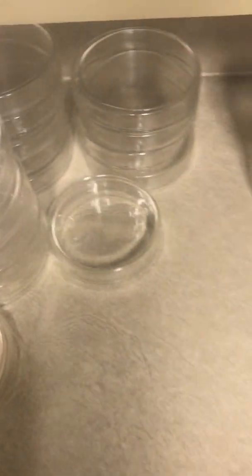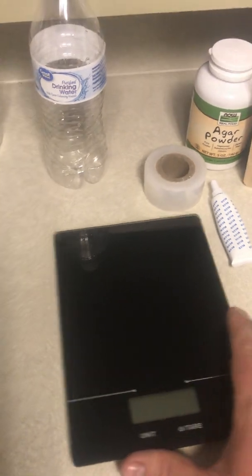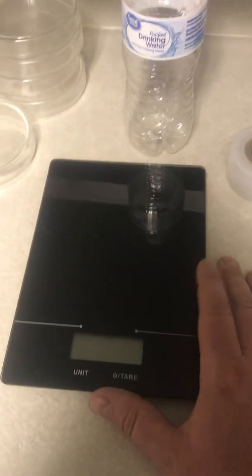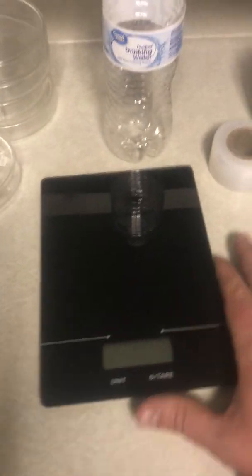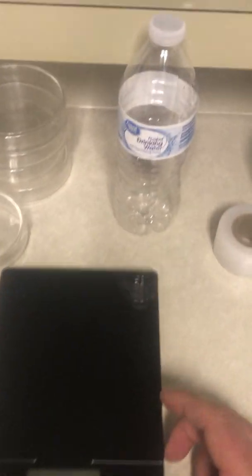On to the agar recipe. I'm going to show some of the agar ingredients here. You need a scale because you have to measure things out — I have a cheap $9 scale; it works but I don't love it — but it's up to you.